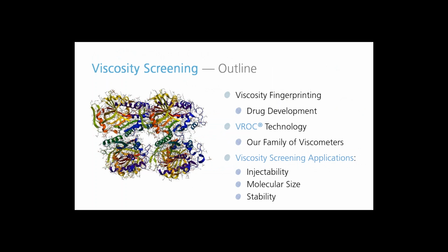All right, at this moment, I would like to move on into the different applications that we're going to discuss during this presentation. I will start with injectability. I will move into some application that is known as intrinsic viscosity, which allows us to measure the molecular size. And I will move on to some stability results that we have achieved with our instruments.